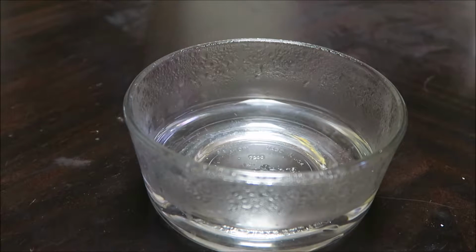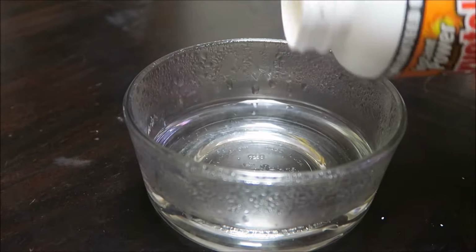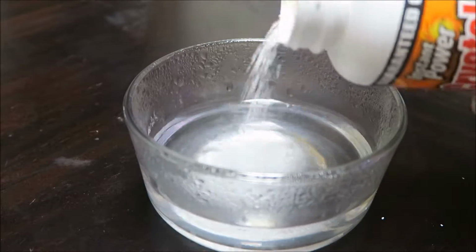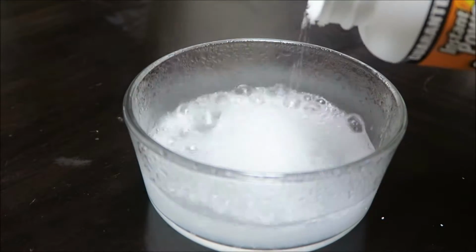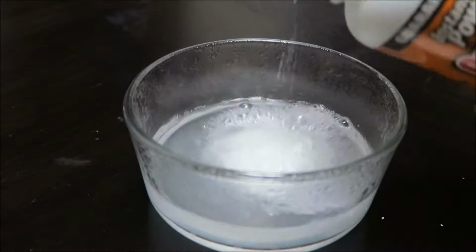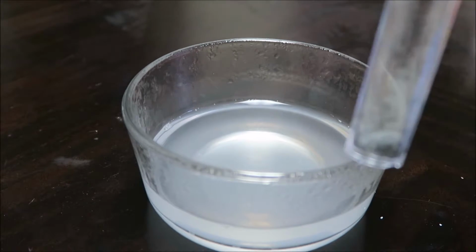Start with boiling water in a glass or Pyrex dish. Absolutely do not use metal or plastic because the sodium hydroxide is very corrosive. Now you're going to carefully add just a few teaspoons of the sodium hydroxide to the water. Now it is effervescent, so you want to add it slowly and carefully. Once you've got a good solution of that, you're going to add your metallic zinc powder.